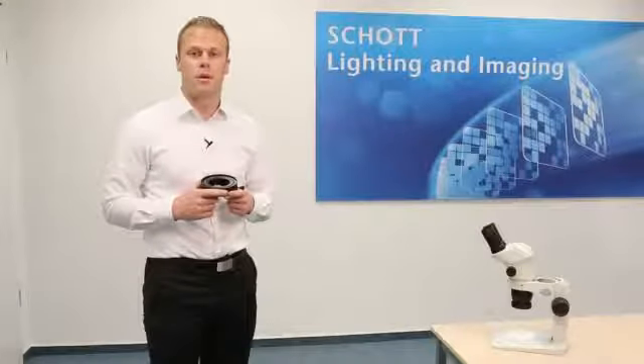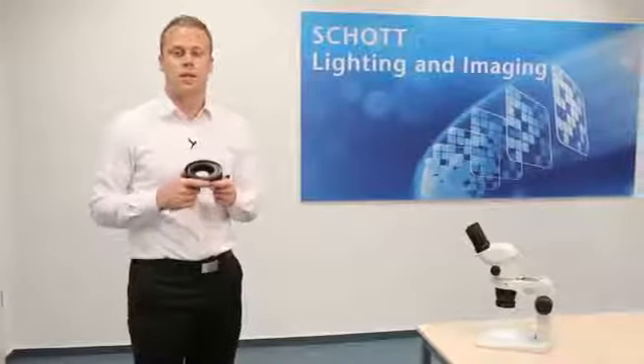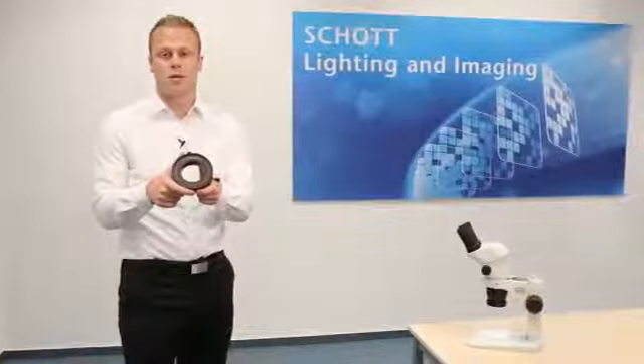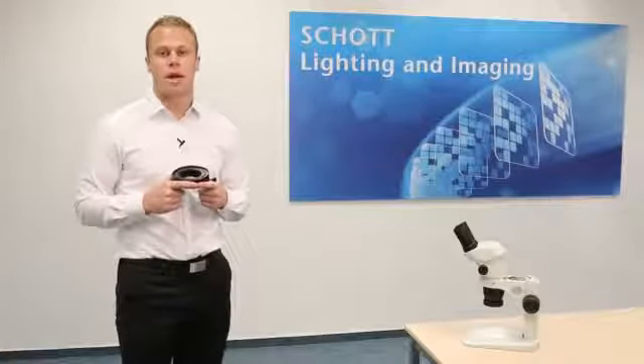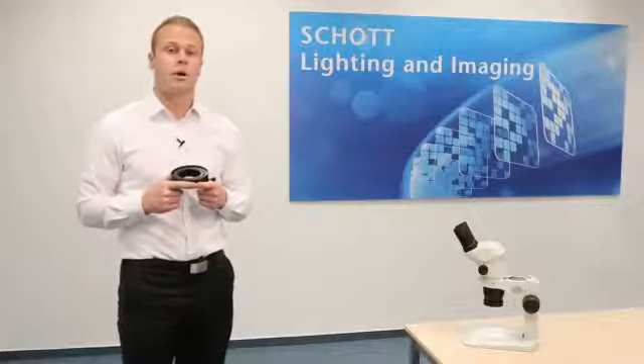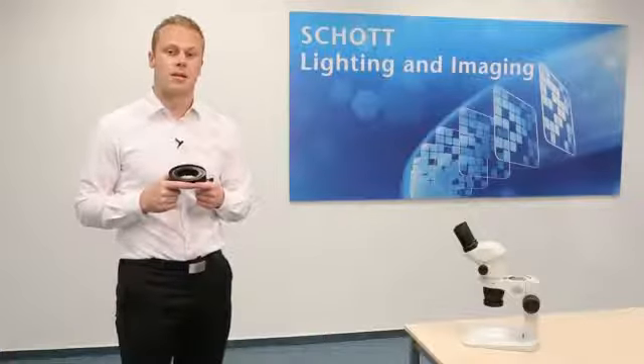Welcome to SCHOTT Microscopy. My name is Preston Zimmerman. Today I'm going to be demonstrating the EZLED Ring Light Plus. SCHOTT's EZLED series covers a wide range of lighting products for stereo microscopy. With a brightness of 140,000 lux, this product is very useful for routine inspection tasks.